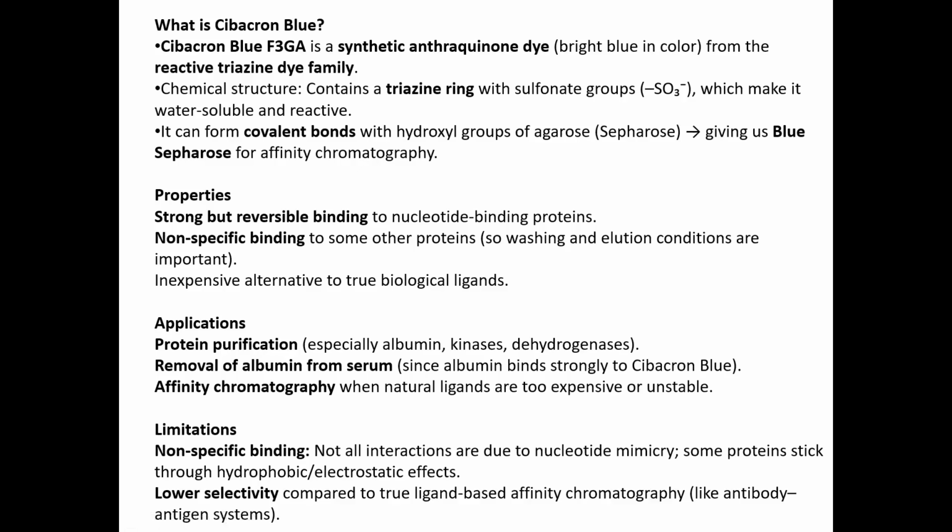Then the main applications are protein purification, especially in cases of albumin, kinase, dehydrogenase, and removal of albumin from serum. Since albumin binds strongly to Cibacron blue, it can be used to remove it from the serum. And in affinity chromatography, when natural ligands are too expensive or unstable, this can be used as an alternative.